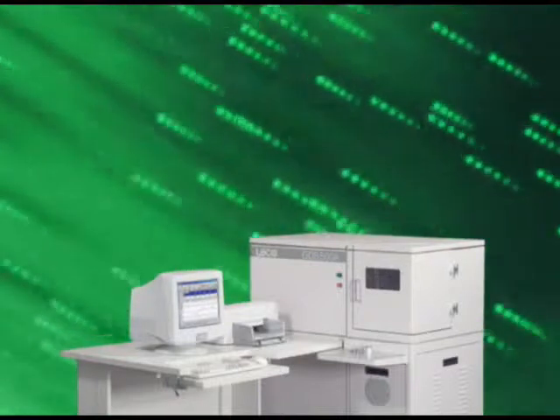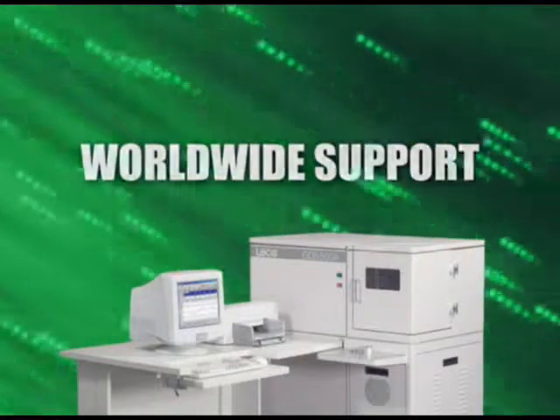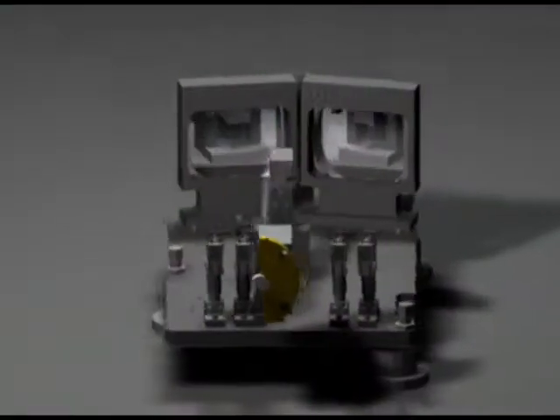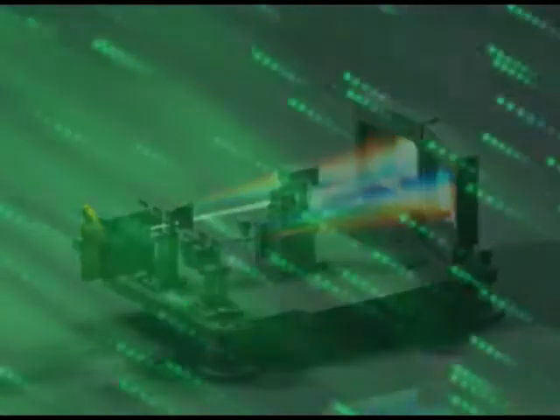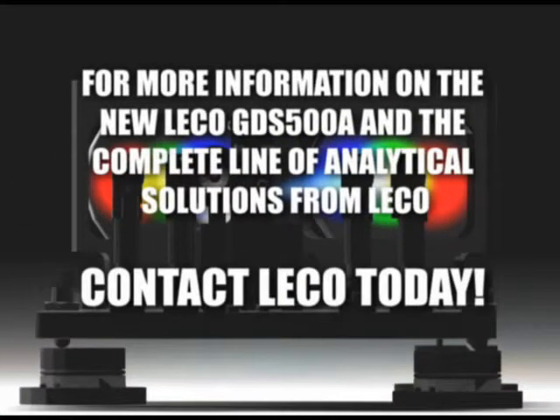Supported throughout the world by a skilled service and applications team, the GDS500 represents the most cost-effective solution for your laboratory from Leco. For more information about the new Leco GDS500 and the complete line of Leco glow discharge spectrometers, contact Leco today.